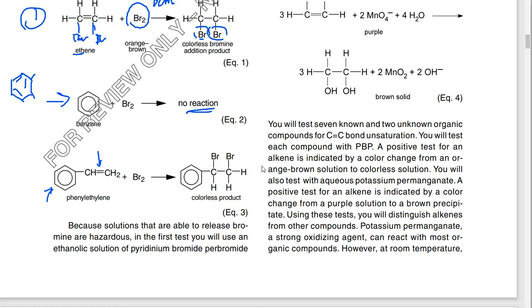Now, here's the thing. Bromine is an orangey brown liquid. When we get Brs grouped together as a combo, we call that diatomic bromine. When diatomic bromine is received in the laboratory and we begin to use it in the lab, that solution is an orangey brown solution. That's just the color that it brings to the table. But when this diatomic bromine rips apart and we get these 2 ions, no longer are those ions colored. Just the bromine that's diatomic as a liquid is colored.